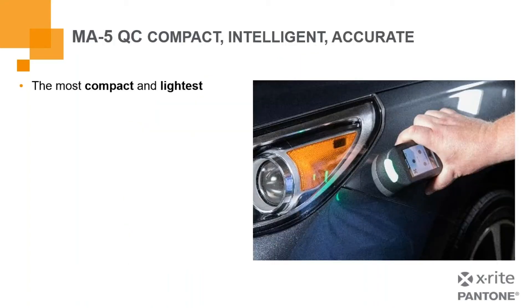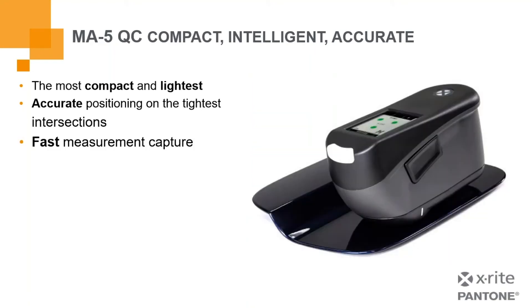The MA5QC, one of our newest, is a very light, very compact instrument. You can see someone easily handling it with one hand and placing it onto a surface challenging in terms of curvature and variation. It gives very accurate positioning on the tightest intersections and offers very fast measurement capture — so you're not stuck holding it waiting for a long measurement time. If it weren't a very fast capture, particularly on a moving production line, that could be a very challenging condition. We have an intuitive touch screen, and at the top, a triangle of three red-green sensors that tell you you're making good contact and can proceed with a measurement.